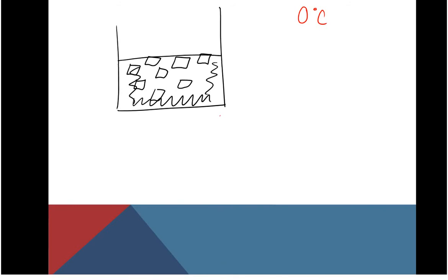But what it does is, instead of allowing it to sit at 0 degrees, it actually is going to lower the temperature of this to, I forget what it was last semester, maybe negative 3 degrees Celsius. And so with that in mind, it allows for the rest of the experiment to work.